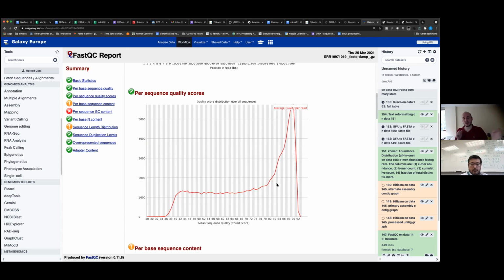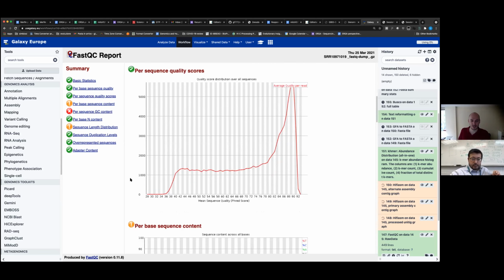So if by chance your fragment is 10 KB, you may go around it 5 times. If it's 20 KB, you only go around it 2 times. Of course, PacBio and the library prep step have been optimized to try to reduce this variability, but there is still some in the prep. This doesn't mean that these sequences are bad. These are also good, but of course the quality is not as good as in the other case.